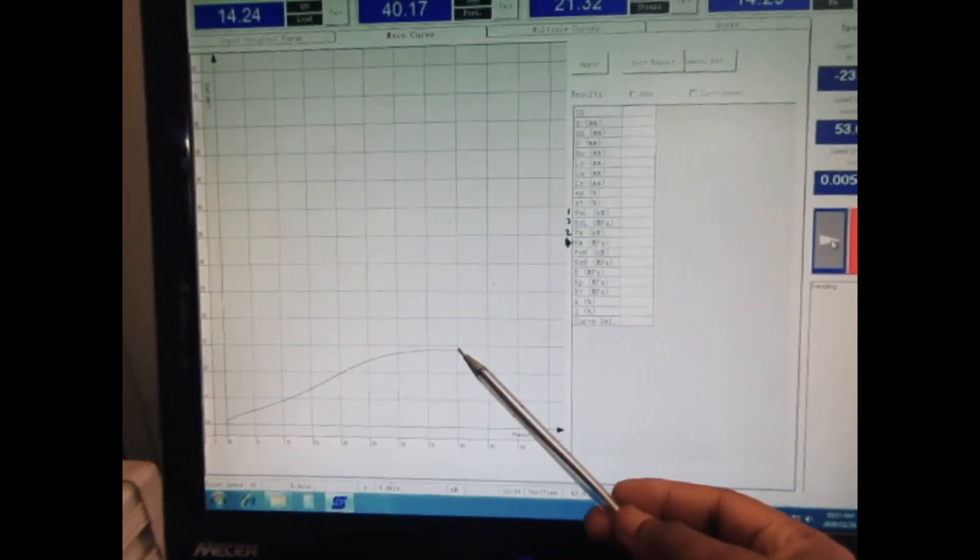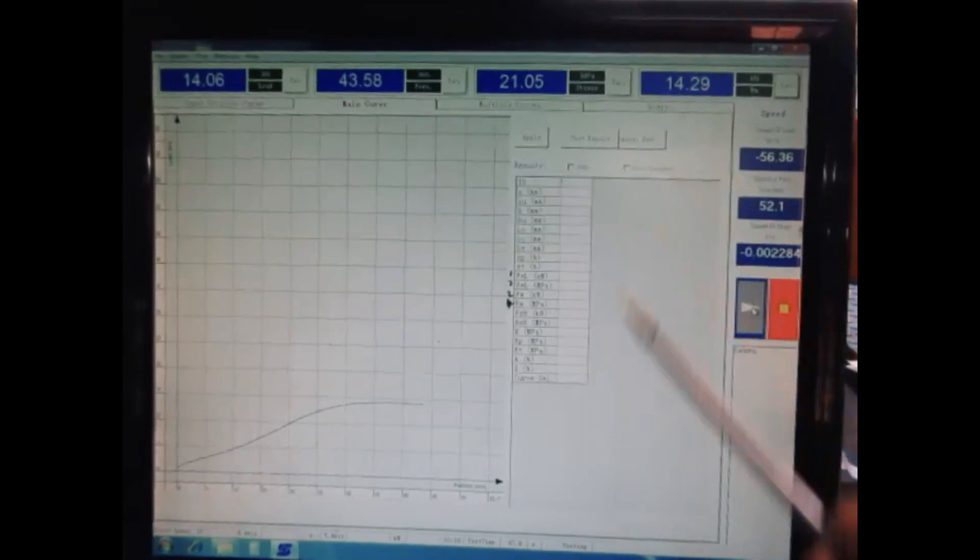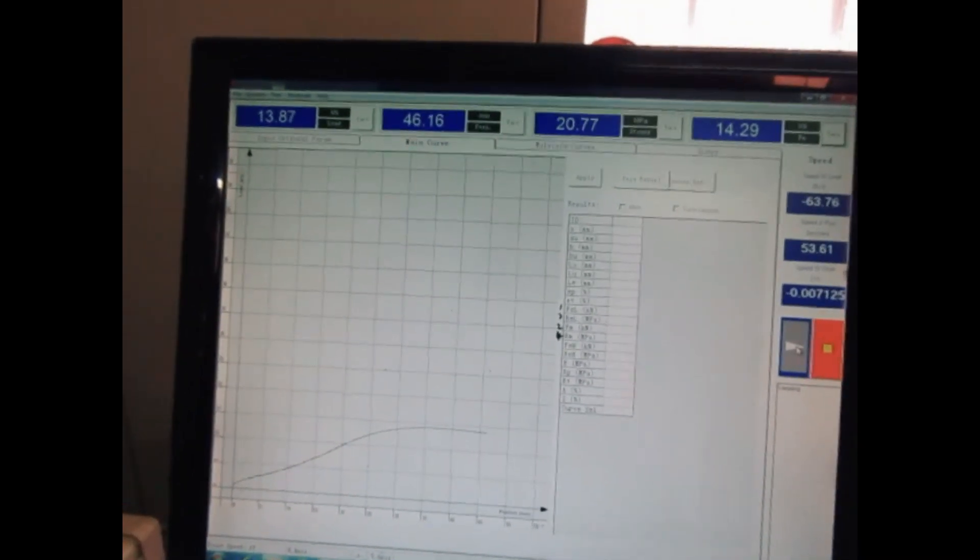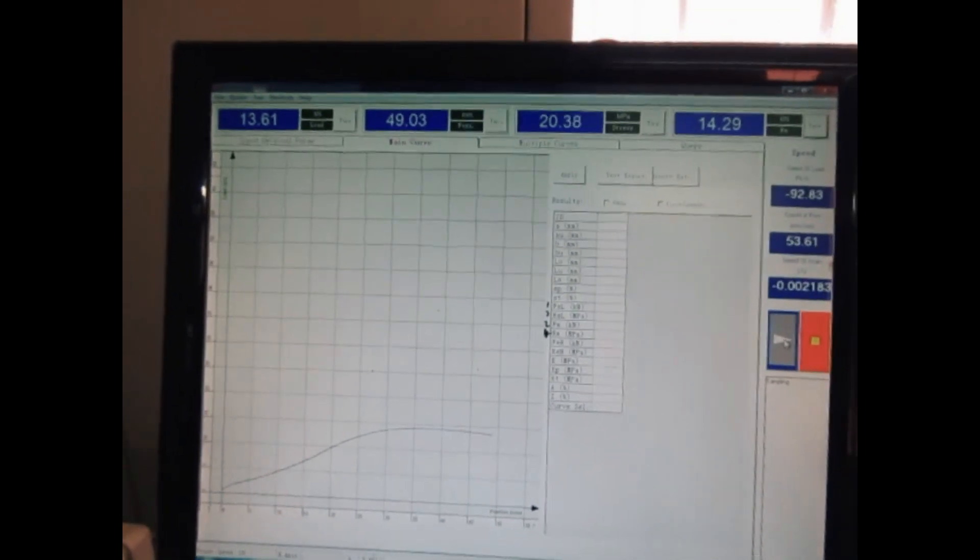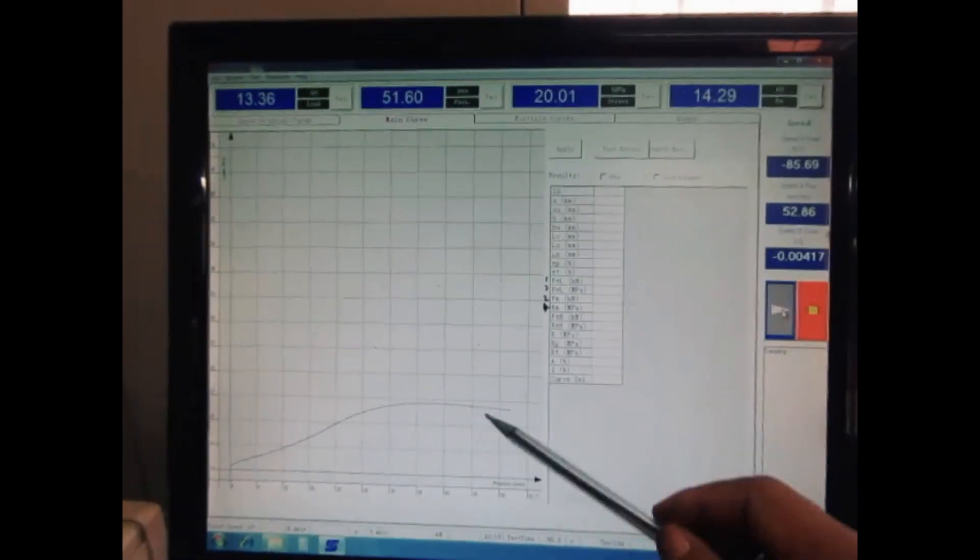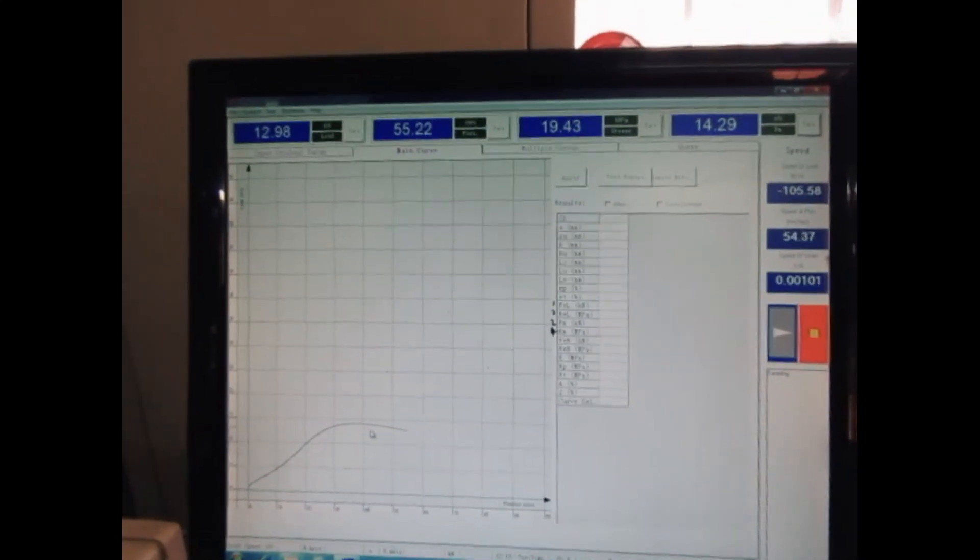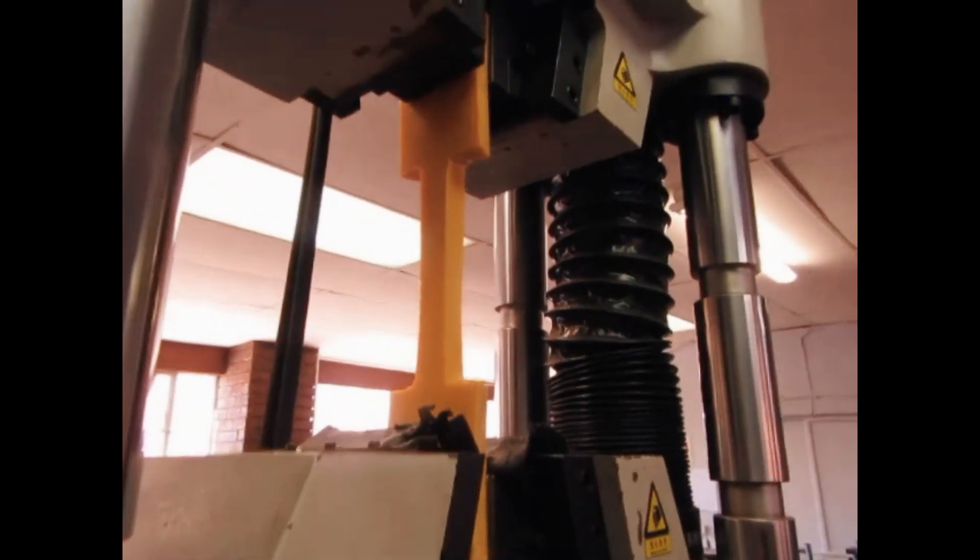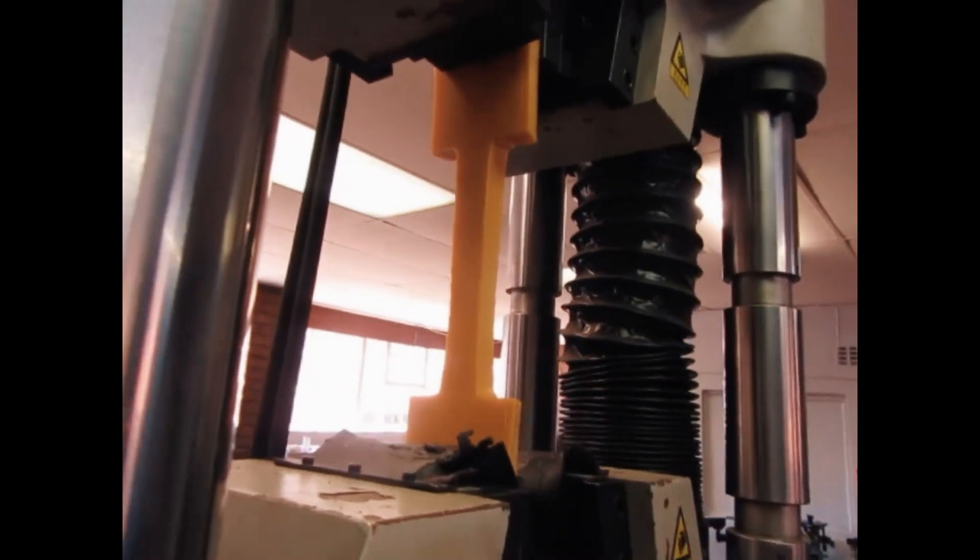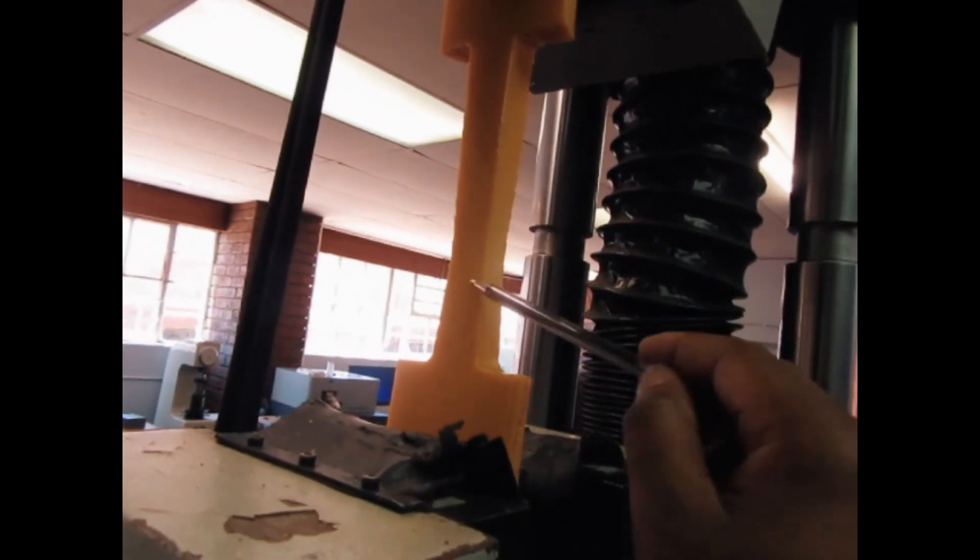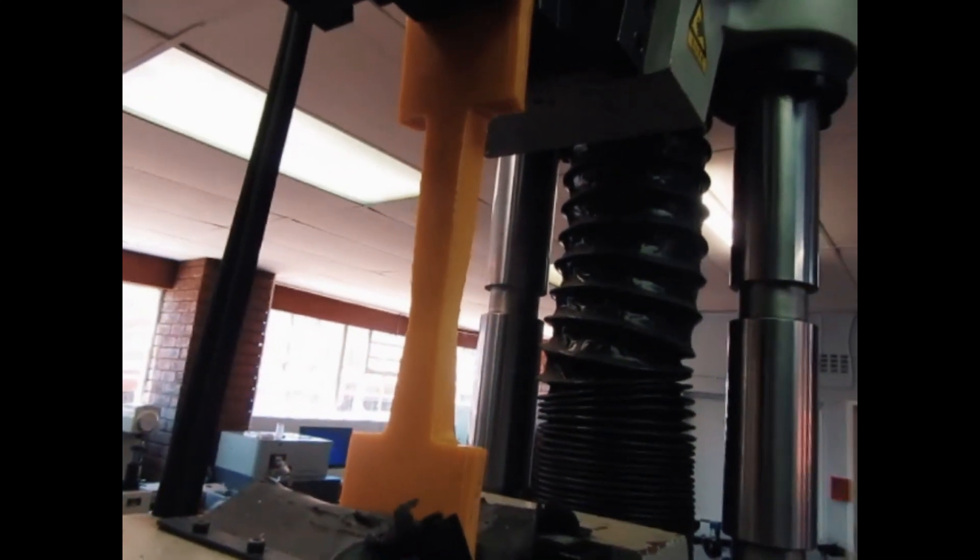Because now I think it's going to be declining now. I've stopped there, which means I'm no longer growing in terms of loads, so the sample can't take more than that. So all I can do, since I don't need much, just need maximum load and stuff like that. You can see that the sample is kind of reducing in terms of size. You can see it's going to make, you know, you can see it from here. You can predict it. See, it's making already there.